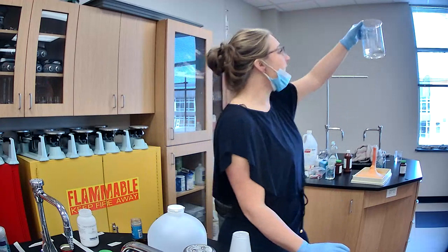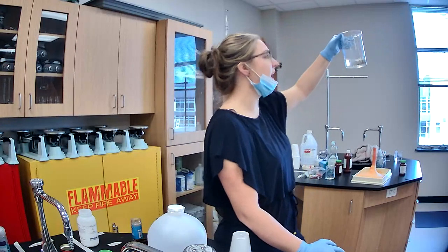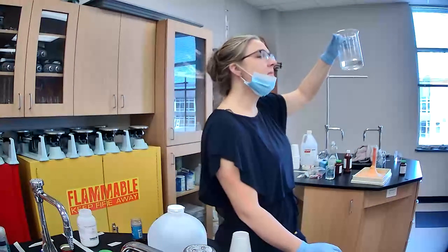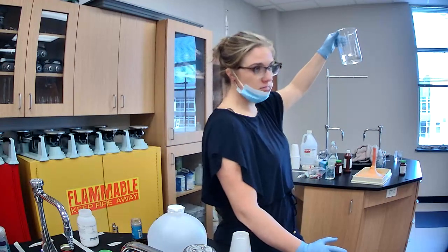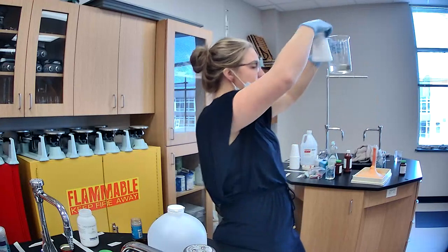All right. Here we have acetone, which is highly flammable, meaning it can burn. It's the same as nail polish remover. What we're going to do is put the foam cup into the acetone and see what happens.